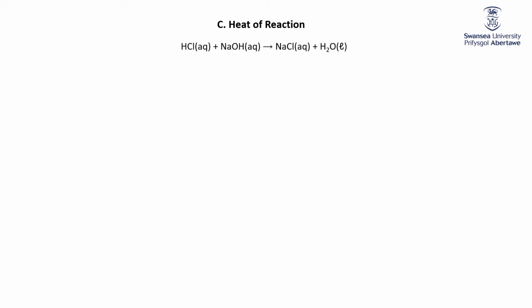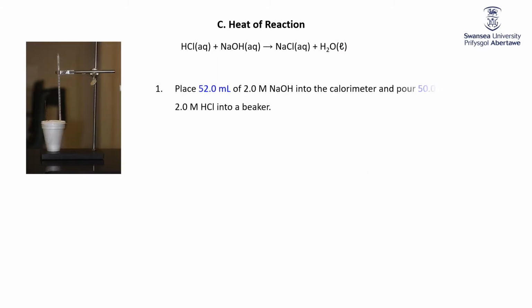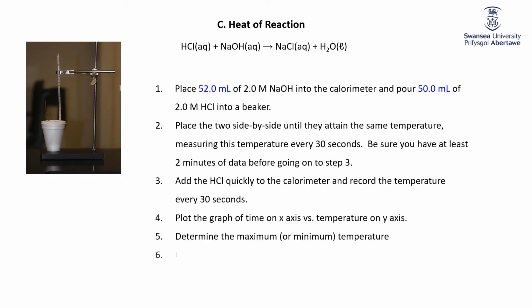Last one, heat of reaction, a nice neutralization reaction. There's our acid plus our base goes to the salt, sodium chloride, plus water. Okay, so again, we're using the standard coffee cup calorimeter. We're going to take, first day, I believe you used 1 molar sodium hydroxide and 1 molar hydrochloric acid.